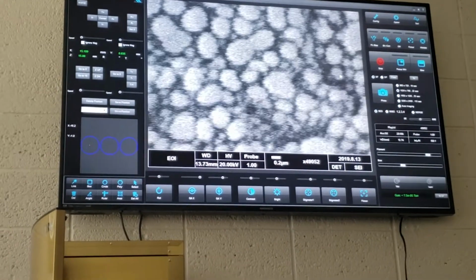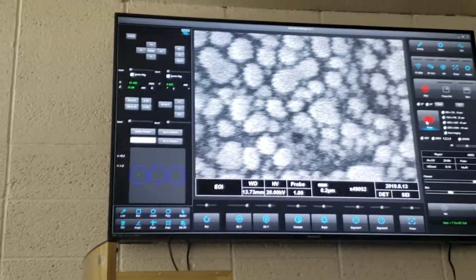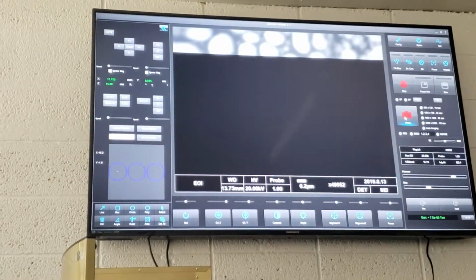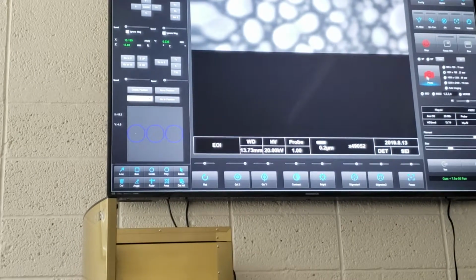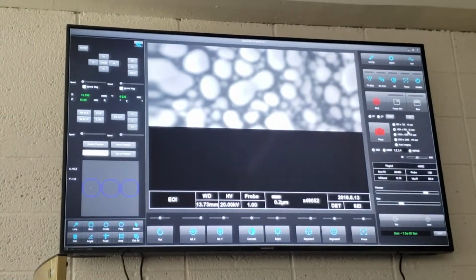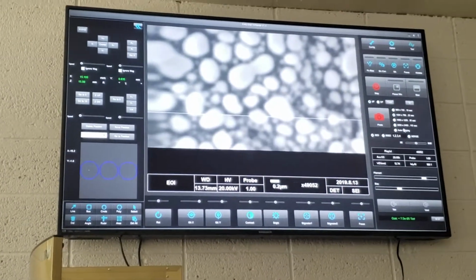But again, up to you, because realistically, I'm going to go photo, and that's going to be our end result of what we're looking at. And photo right now is taking a photo of this at 1024 by 768 resolution. And I can adjust those to whatever I want it to realistically be.